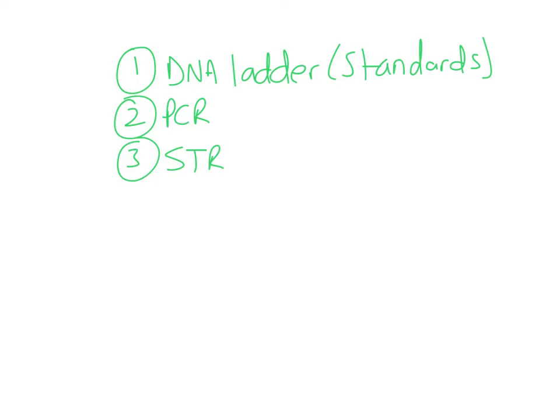I think all three of these things are basic stuff from case one of that CSI lab, and it's what I'm going to quiz you on, so I wanted to be able to review it. So let's start with the first one. The first one is, what is a DNA ladder?